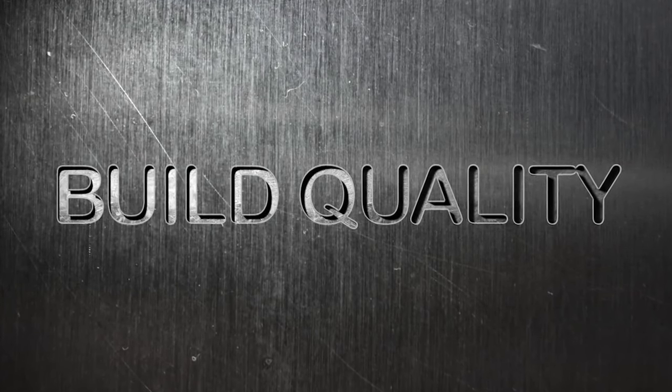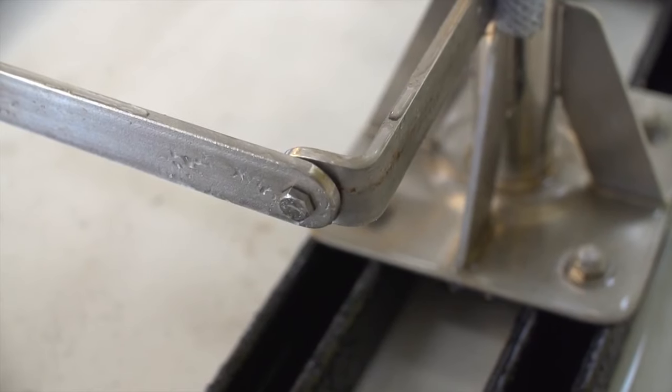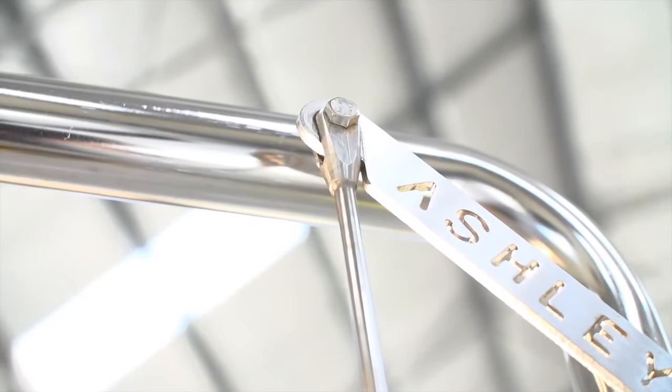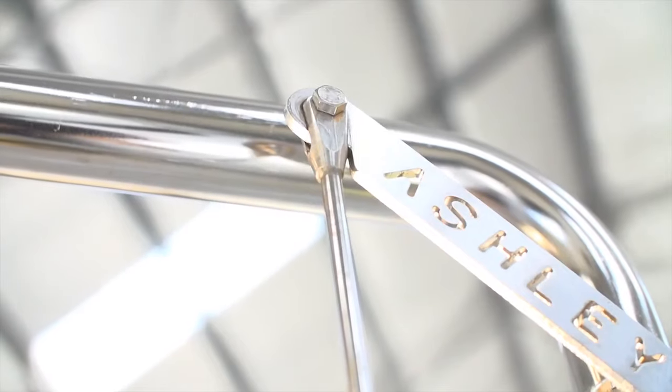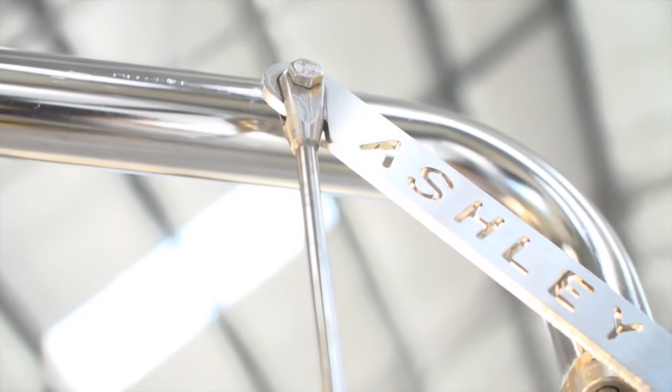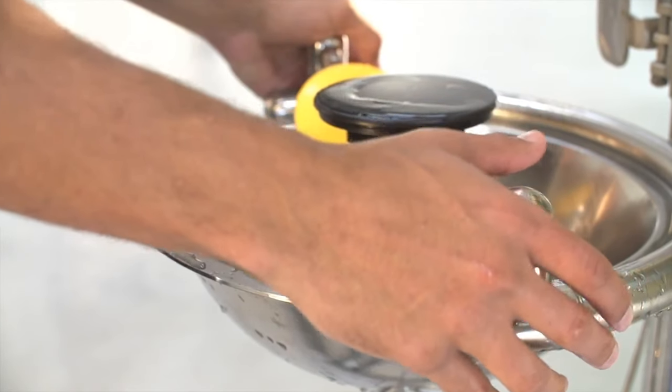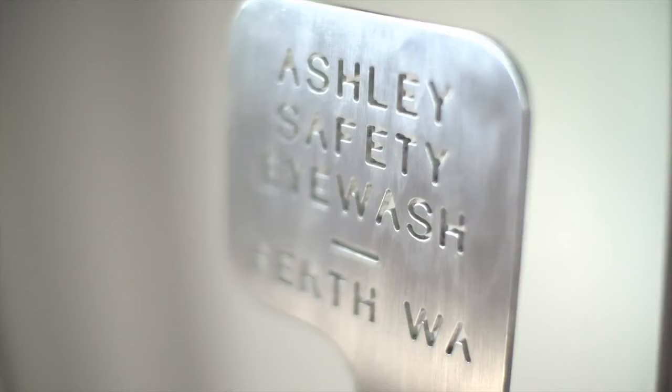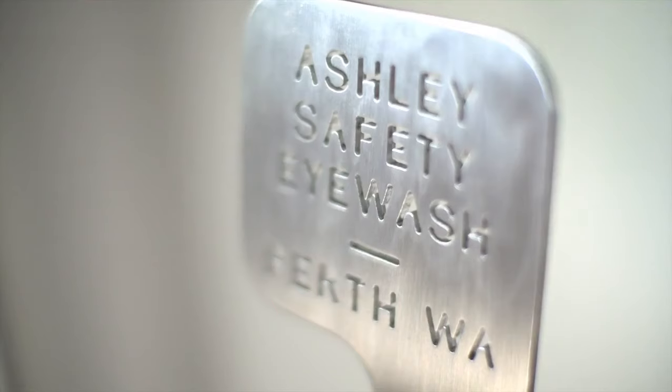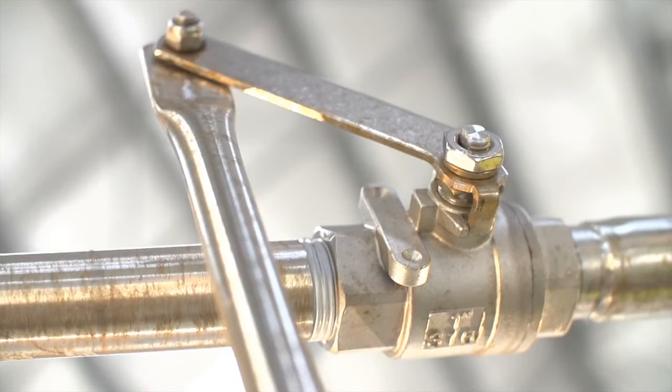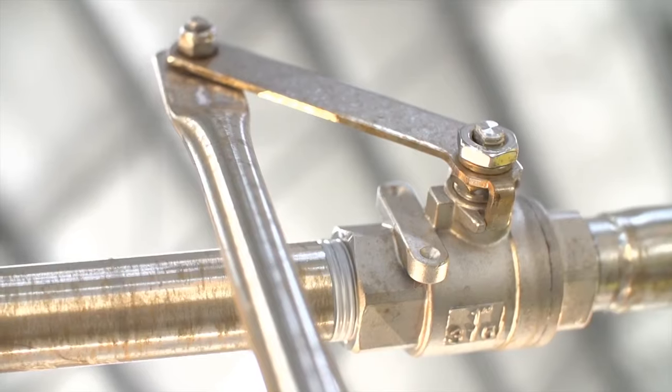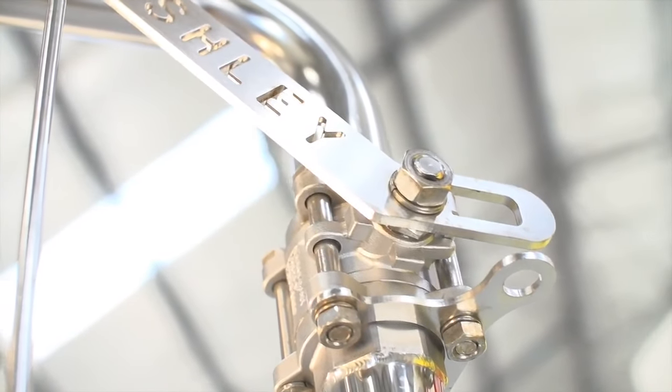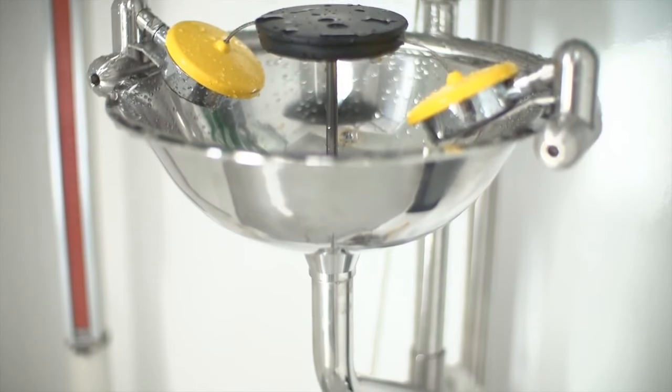Overall build quality: The Ashley safety shower has a superior build quality to other showers. Each part has been carefully engineered and designed, and no shortcuts have been taken. Every point of the design has been purposely rounded off for safety reasons, and the entire unit is constructed of marine grade 316 stainless steel. Where other showers corrode after just months of use, Ashley's is built to stand the test of time. Generally, service life is a minimum of 25 years.